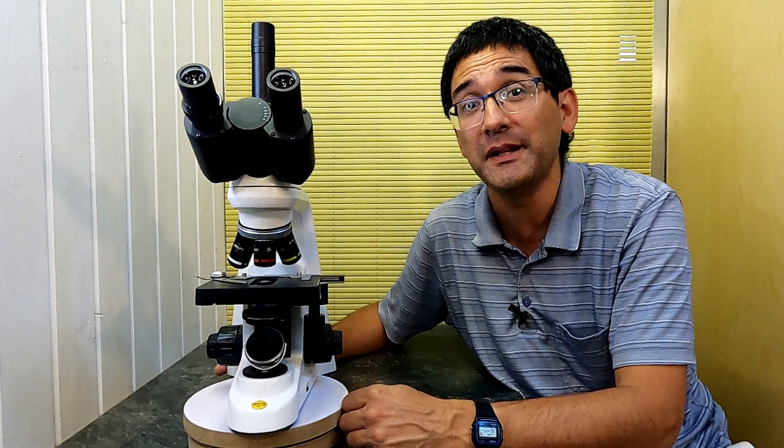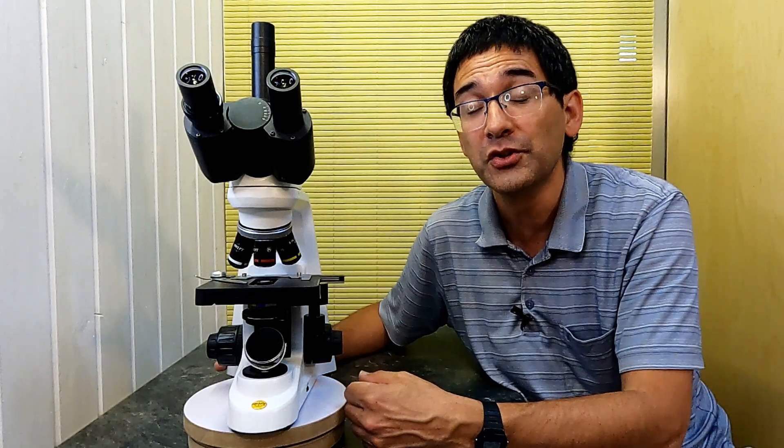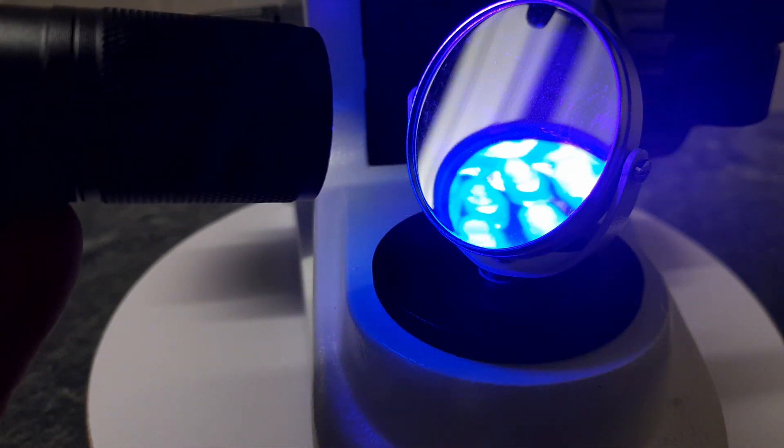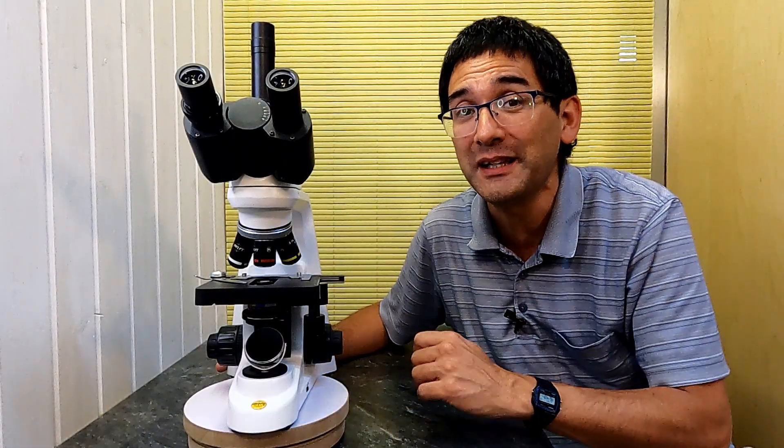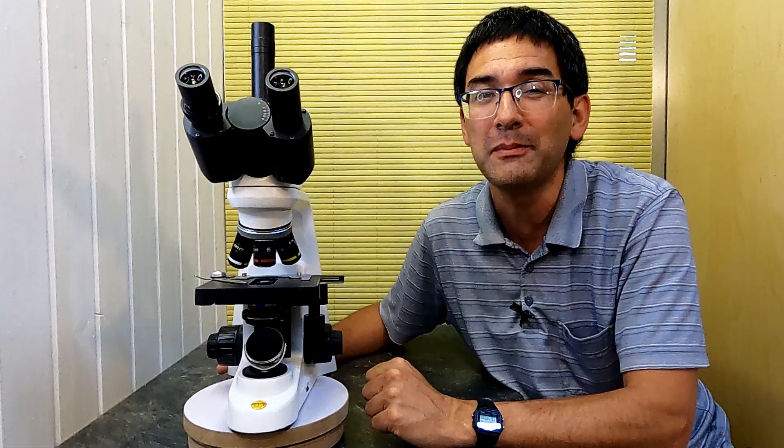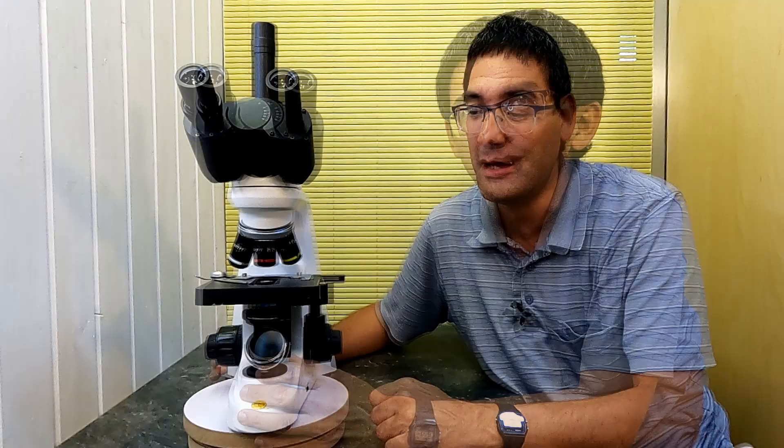And the second advantage of using a mirror is that you're now able to also use a light of a different color. So there are certain flashlights that have colored LEDs. And by using those, you are also now able to change the color around. And what I would like to do in the future, I've not tried it out yet, but I'd like to, for example, use ultraviolet light. And I would like to see if it's not impossible to actually use this as a fluorescent microscope. When you use a UV flashlight, for example, then maybe it's possible to make some structures visible that could not be seen otherwise.